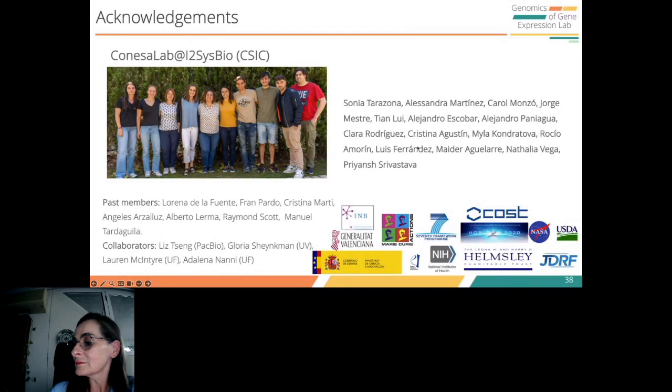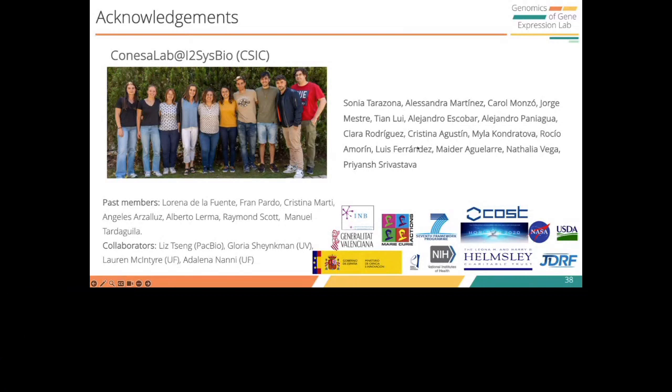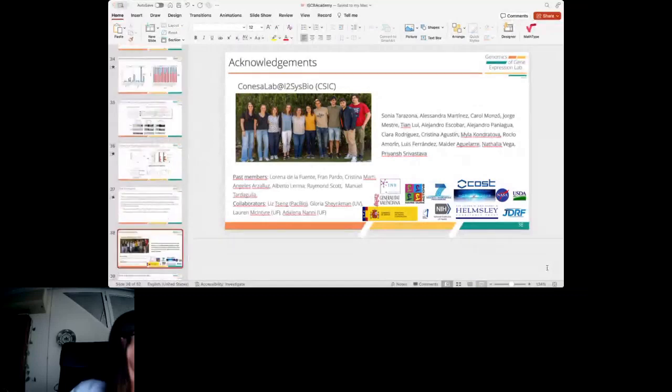Excellent. That was very informative. A lot of data packed in there. So we do already have some questions in the Q&A. The first one here: you note that simulated data does not simulate library preparation errors. How impactful do you suspect those library preparation errors may be on performance, or can that not be estimated as it's instance dependent?